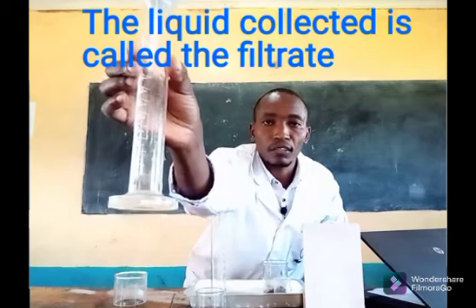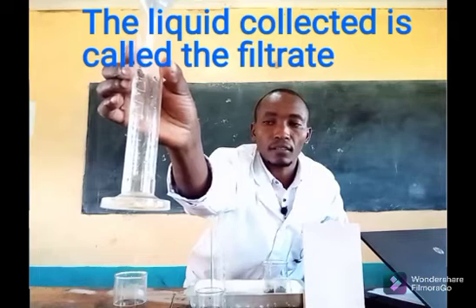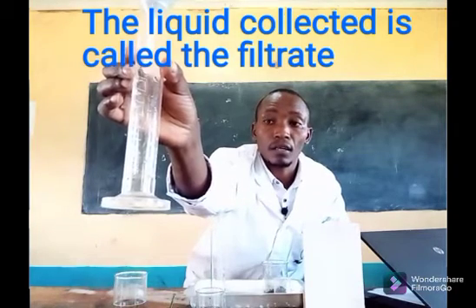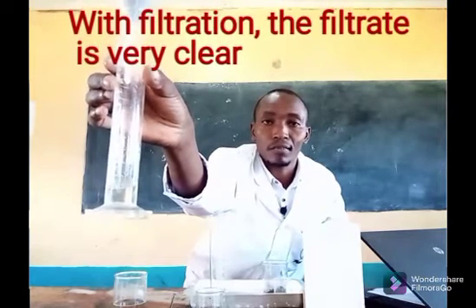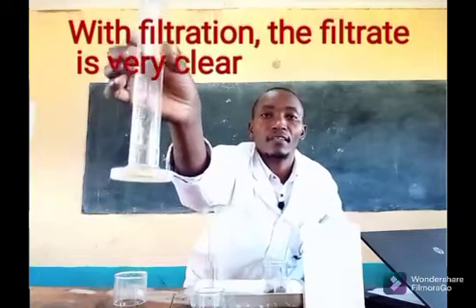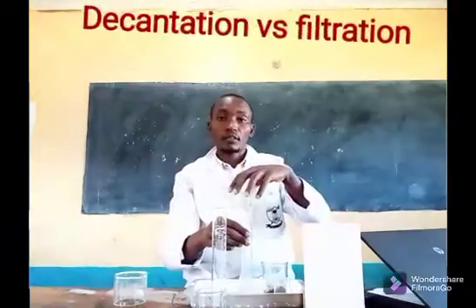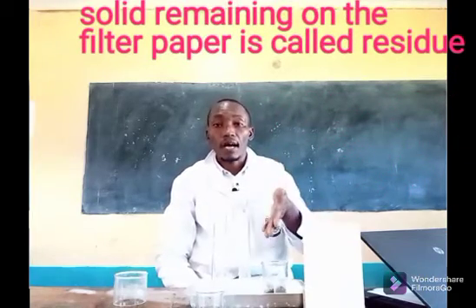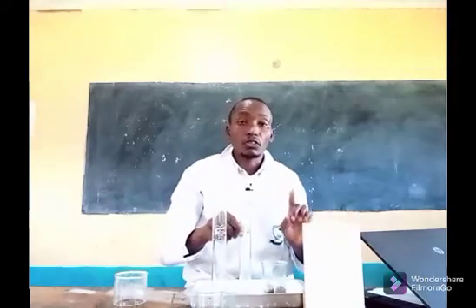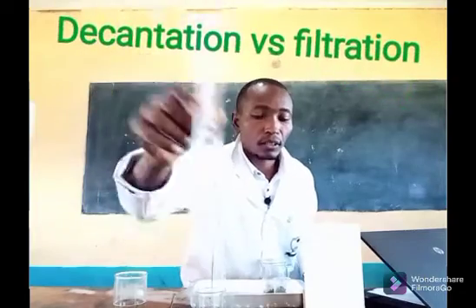Can you look at the filtrate? Whatever is being collected, the colorless liquid being collected is the filtrate. That is the filtrate. Consider how it looks. Very clear, very clear. So this process is filtration. At the end, I will have a solid remaining in the filter paper or in the filter funnel, and that is called the residue. So I have the residue and the filtrate. So that is with filtration. Consider the appearance of the filtrate.